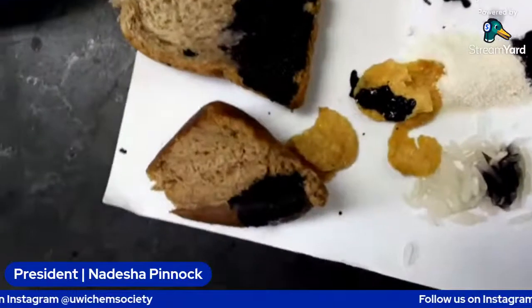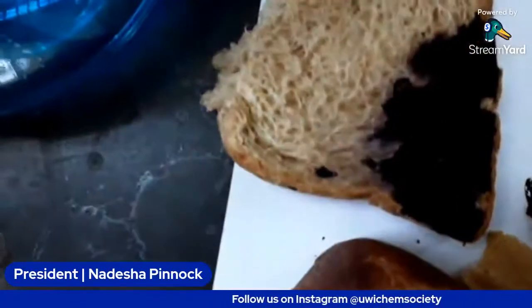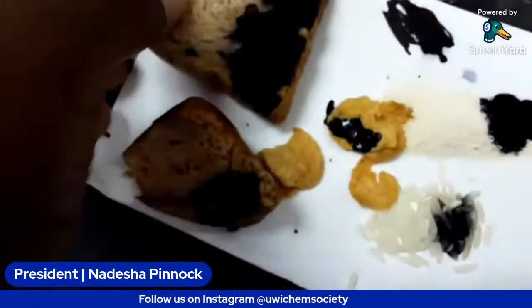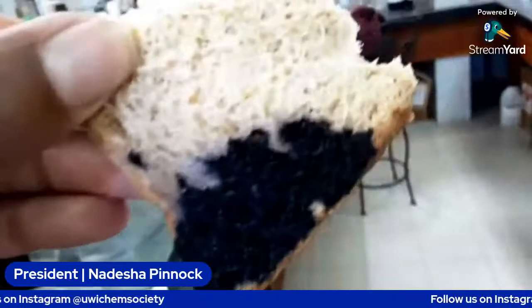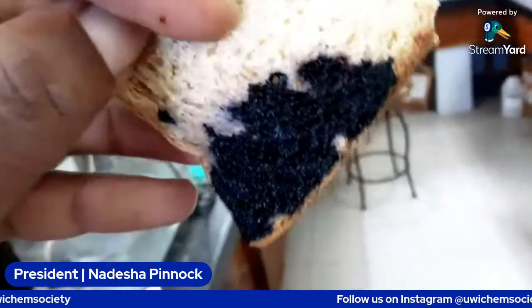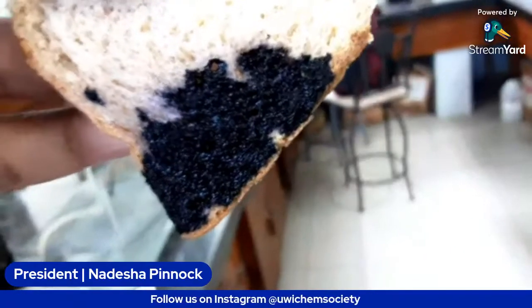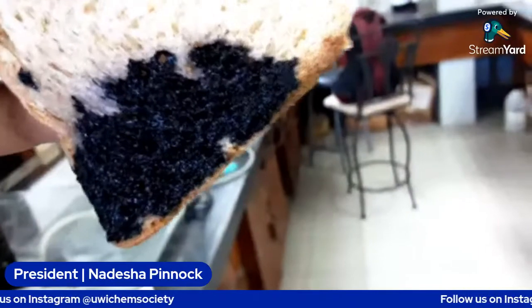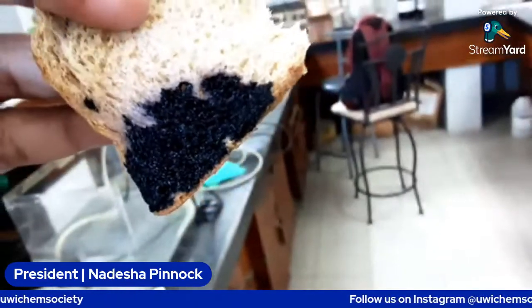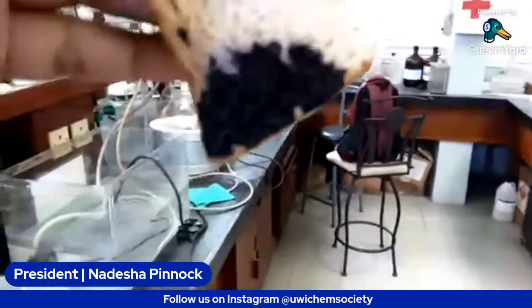That is very straightforward. If you're looking at the outer edge of where the reagent is, it looks slightly purple. Don't know if you guys can see that. But in reality, of course, we describe it as blue-black.